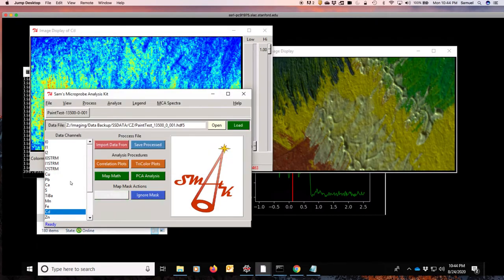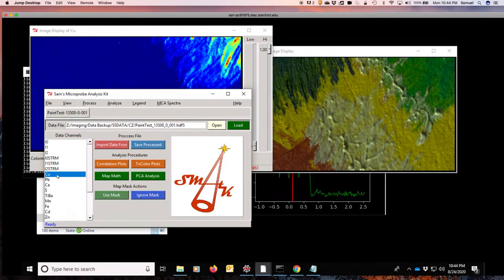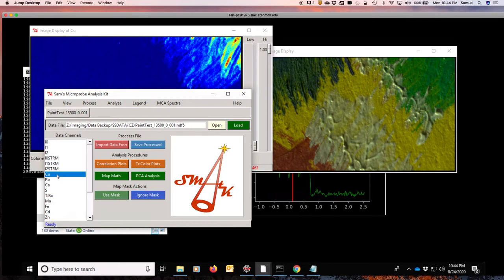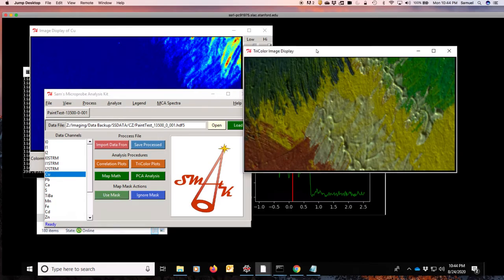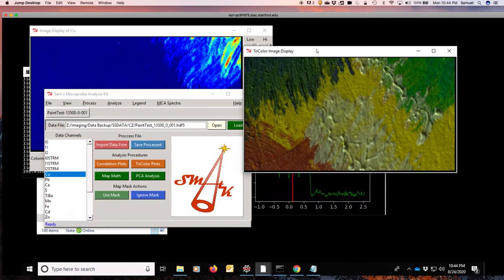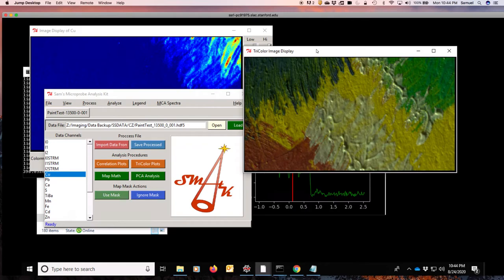So we have a really good distribution of now both color and the elements that are corresponding to that color. So this is a great way to use the UV-visible spectrometer to actually look at the color of the sample. And this is an as-pixel resolution image of your sample. And we find that this is actually a much higher resolution in terms of getting that 5-micron or 2-micron resolution than the actual image capture of the sample itself. So if nothing else, if you're looking for a true color representation of your hyperspectral image, this is the best way to capture that image.